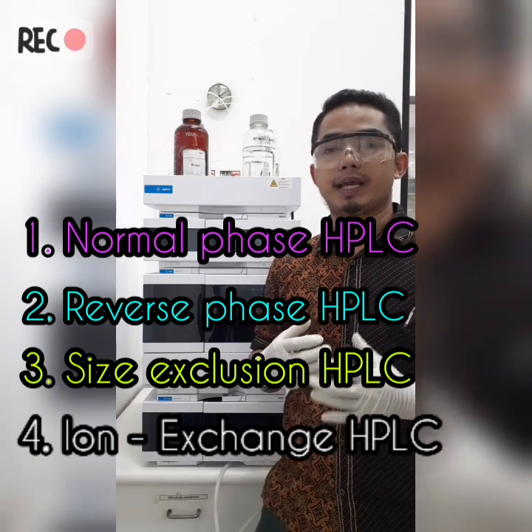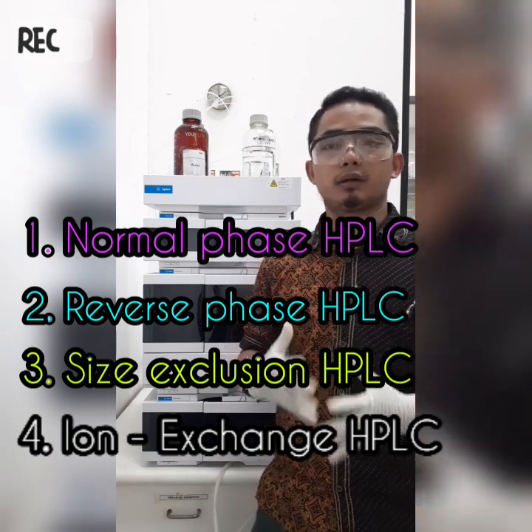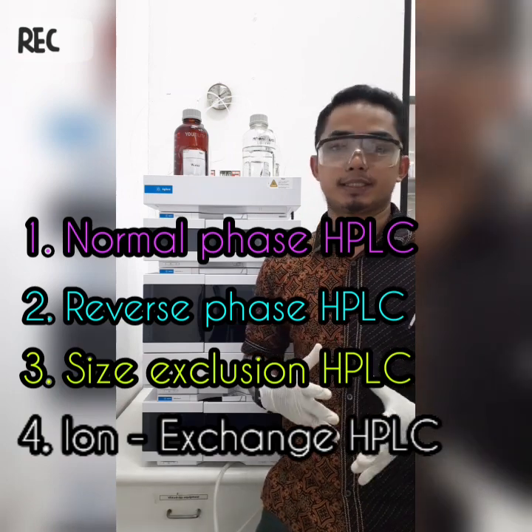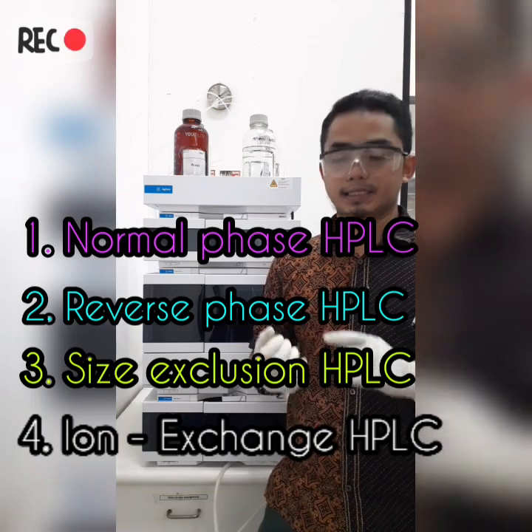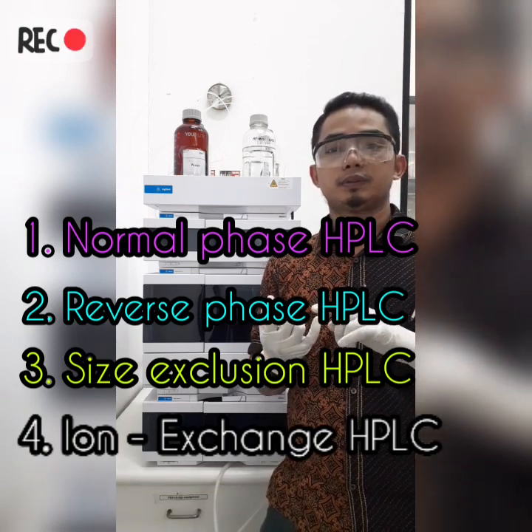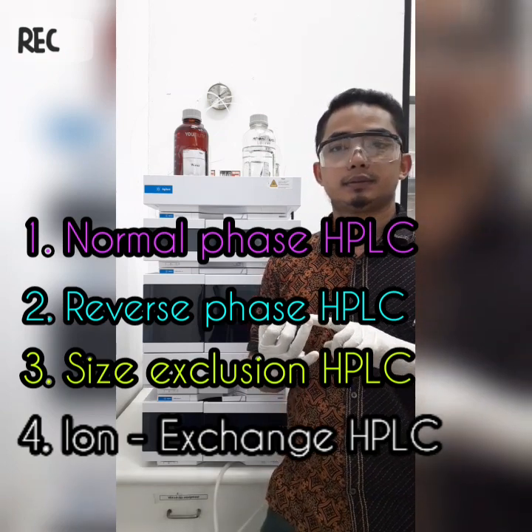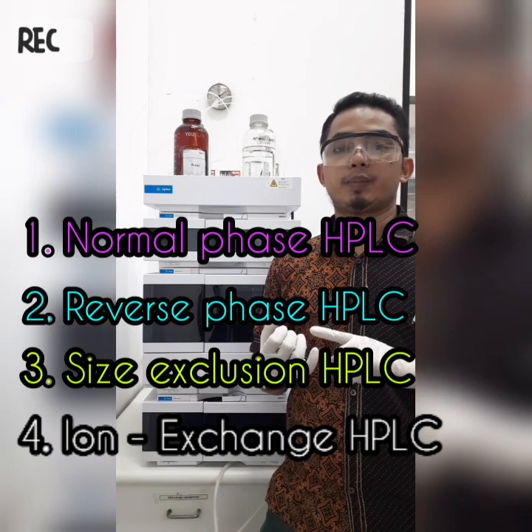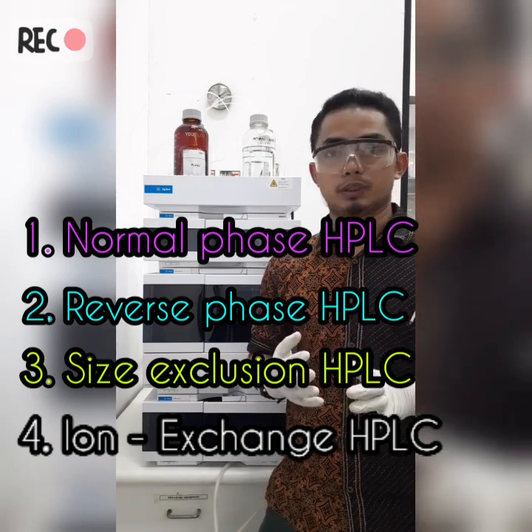And typical mobile phases are hexane, methylene chloride, chloroform, diethyl ether, and a mixture of these. So the key of normal phase is the difference of mobile phase and stationary phase. For normal phase, the stationary phase is polar and the mobile phase is non-polar.